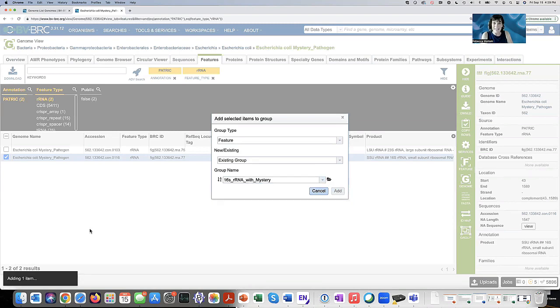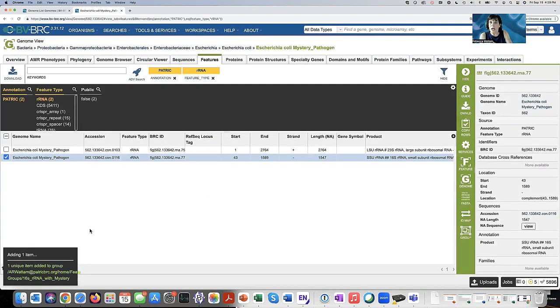So it added something in. You know, it's like your shopping cart. Of course, we're all going through the grocery store, shopping for sequences for ribosomal RNA of different flavors. And so from different aisles, you can grab it and put it all into the cart. How cool is that? So now let's do a gene tree of that.